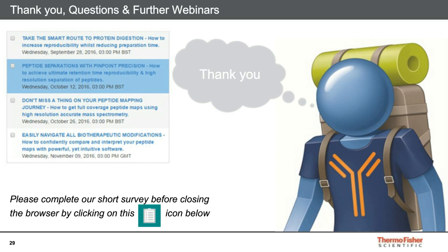We have another question, again from BioAsta. What is the best digestion time to use for plasma samples using the Smart Digest kit? We recommend for IgG in plasma digestion times of 75 minutes.